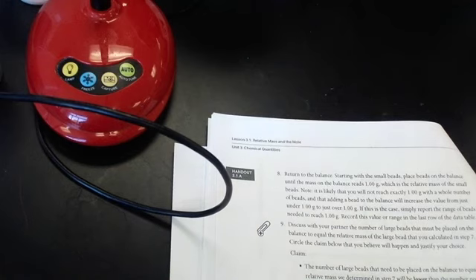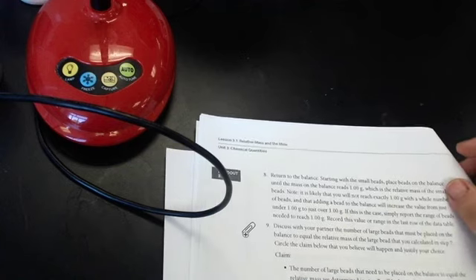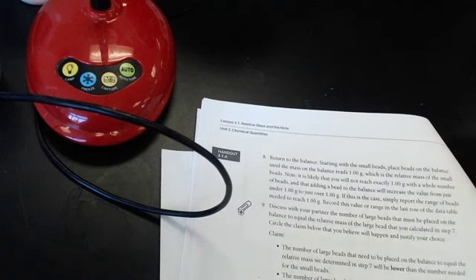What we're actually going to do is that we know the mass of the cup, so we're just going to add beads until it equals 1 gram above, which is the relative mass of the small bead. Note, it is likely that you will not reach exactly 1 gram with whole numbers of beads, and that adding a bead to the balance will increase the value from just under 1 to just over 1 gram.